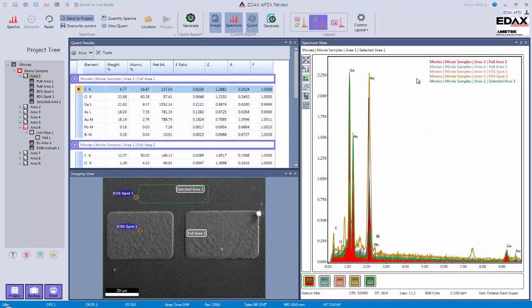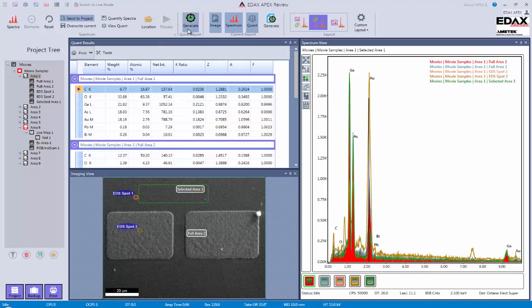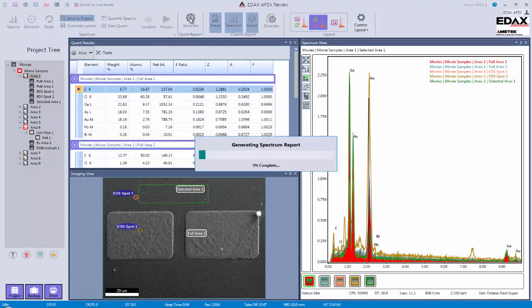Now to do a report, I can do two options. I can either do what's called a quick report or a custom current report. A quick report is going to basically dump all the data, the spectra themselves, the image, and this into a quick report. And you click on the button, and it pops it over here into our report generator.